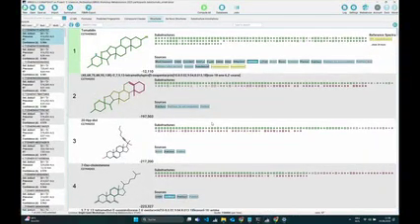Okay, now we look a lot at this particular compound tomatidine and see that it fits quite well. What we have here is now, besides all of these structured databases like HMDB, we also have some yellow boxes, which are actually for custom databases. So now I will show you how to import these custom databases, and what you will also see is you will have this 95% hit for this database called MassBank, and this is a hit in a spectral library. So I will also show how to import these kinds of databases.